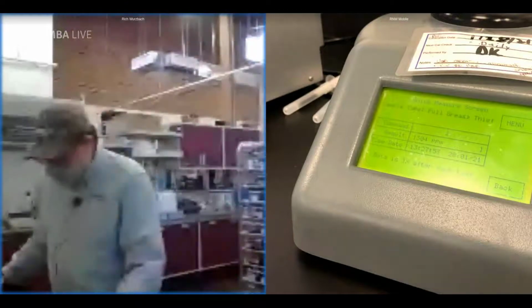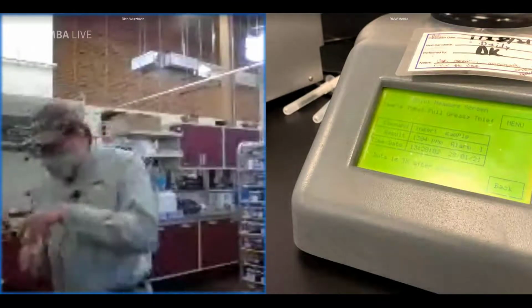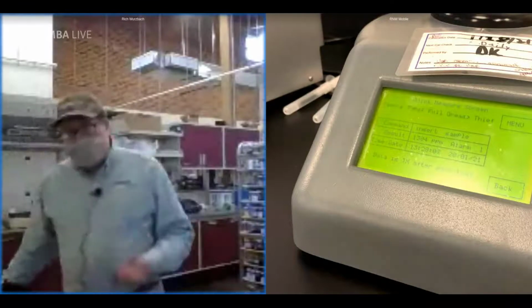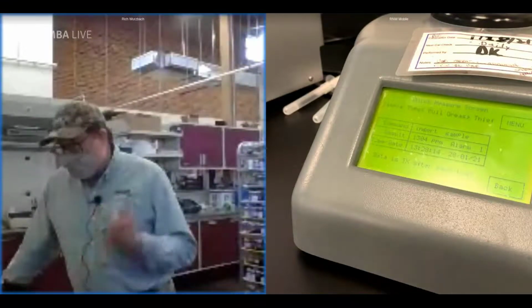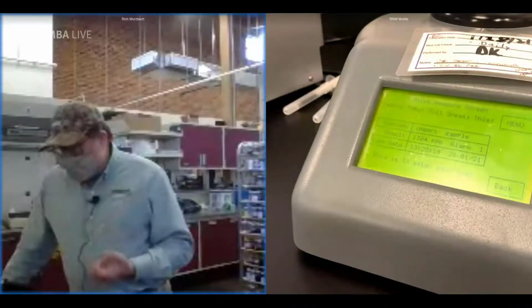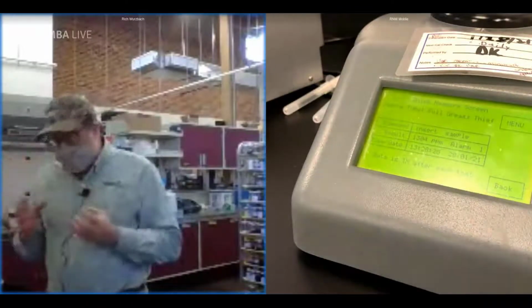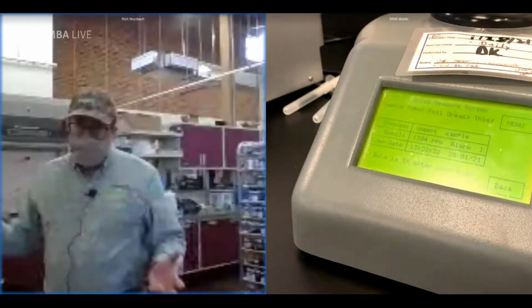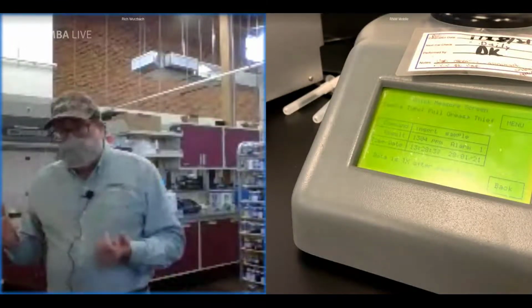And it gives us a value of 1304. Now, when you look at the ASTM standard, it does reference this device. For a number of years, we did a lot of research with this, some international research, especially in the wind area. And we were able to get this instrument working fairly well as a tool for this. But the problem is it's been discontinued and there isn't really a functional replacement for it that works on this principle of having the coil and then having the sample going into that entire coil. Because as I said at the beginning, you can't shake up the grease sample and you can't evenly distribute the particulate. So it creates the same problem, say, if you wanted to use a PQ analyzer.